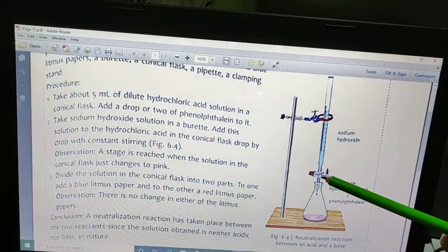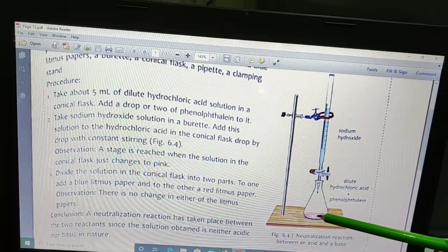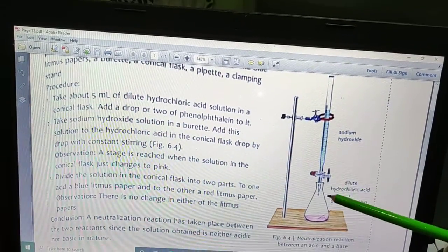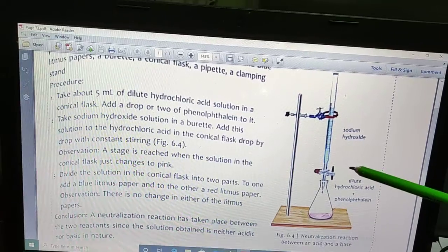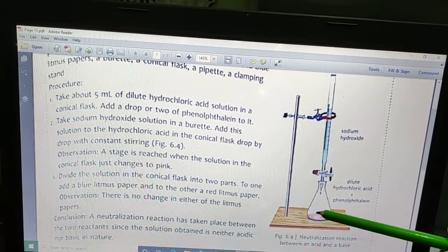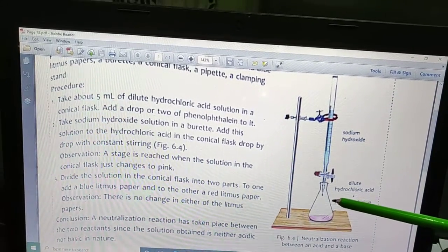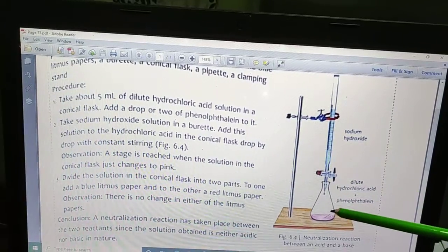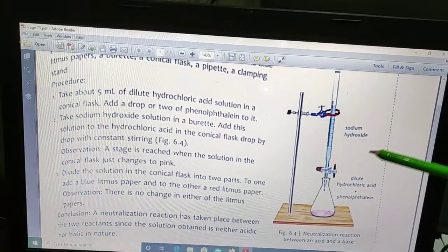Now what we'll do is we'll just open this tab so that sodium hydroxide from the burette starts flowing to the conical flask. You'll observe that after adding sodium hydroxide, the color of the solution will start changing into light pink color. When the light pink color does not disappear, then that is the endpoint or we call neutralization.